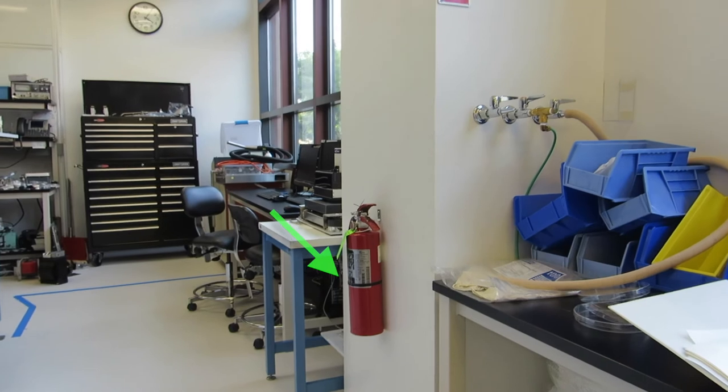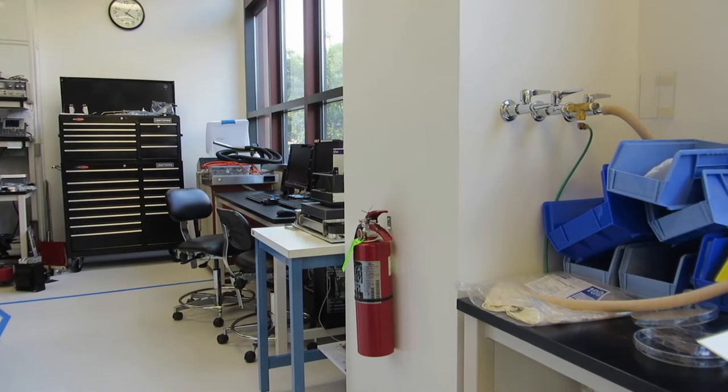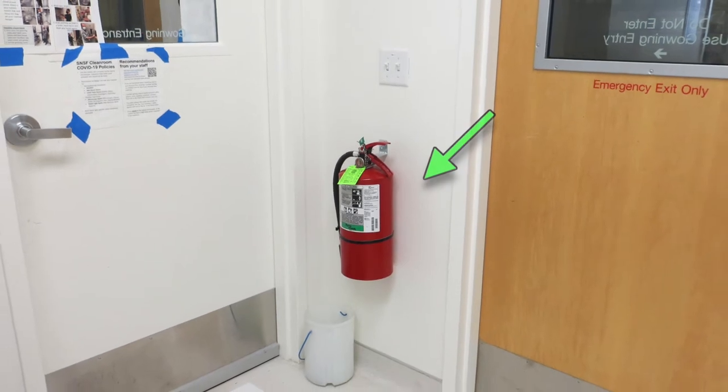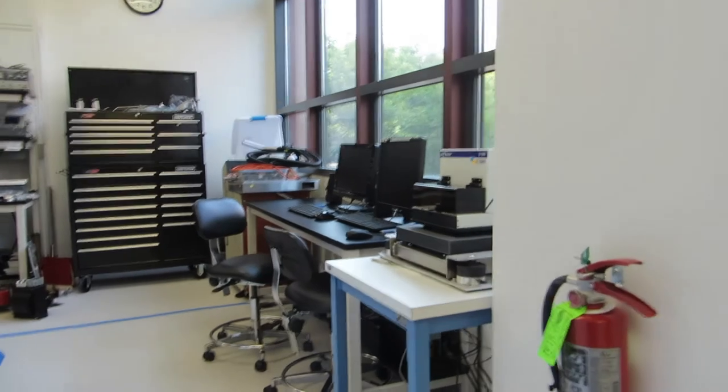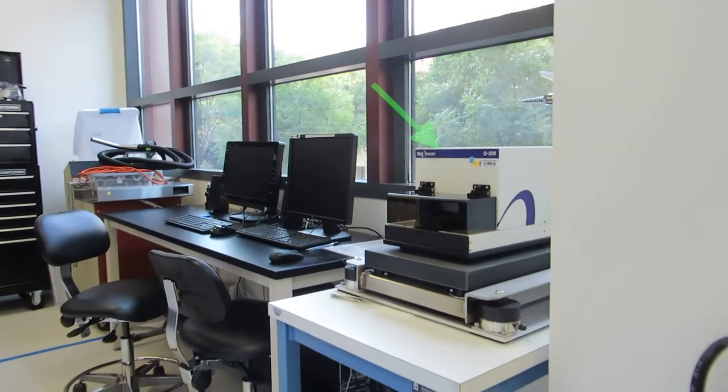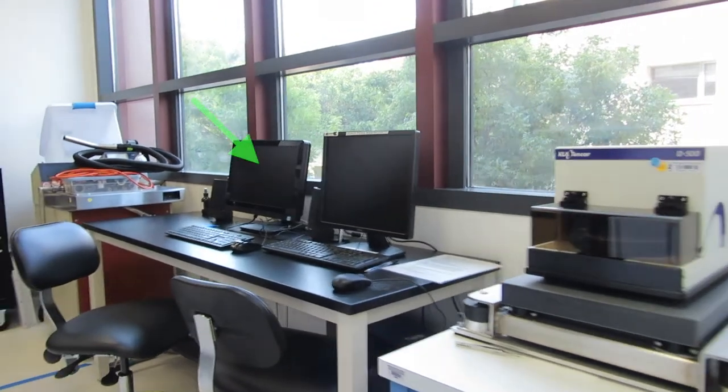On this post is where the fire extinguisher is mounted. There's also another bigger fire extinguisher in the gowning room in the corner right by the exit. And down here near the end of this hallway is where the profilometer is located. To the left of it is a general use computer used for making badger entries.